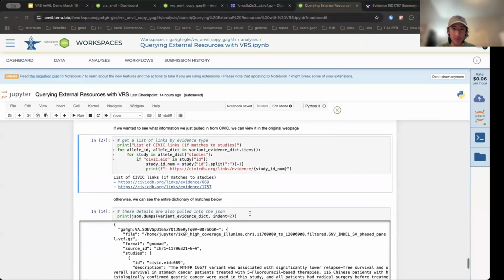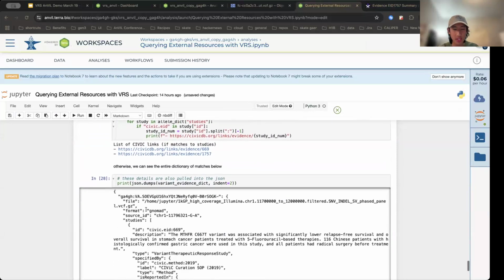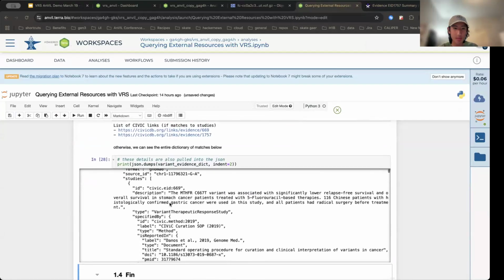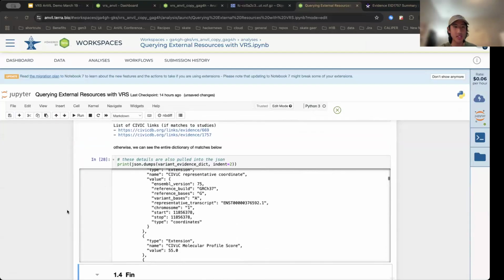And if we wanted to parse or even look more into or do further processing for that, we could take that whole JSON that we'd created from MetaKB and make use of anything that's there and form those evidence statements and so on.